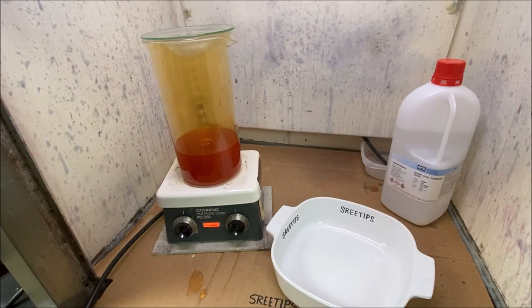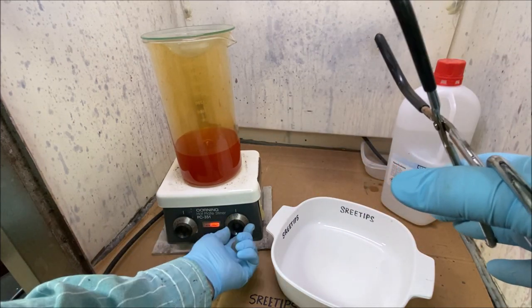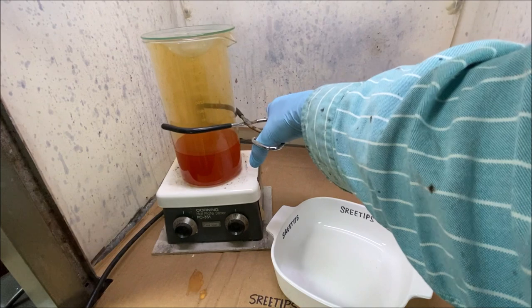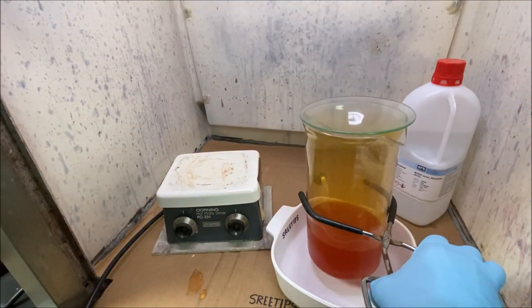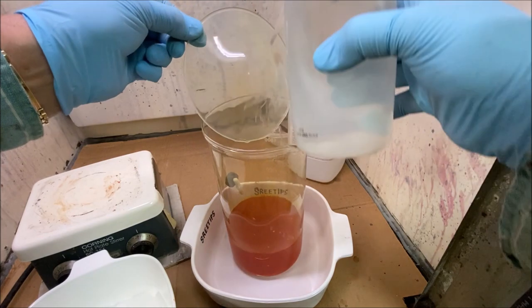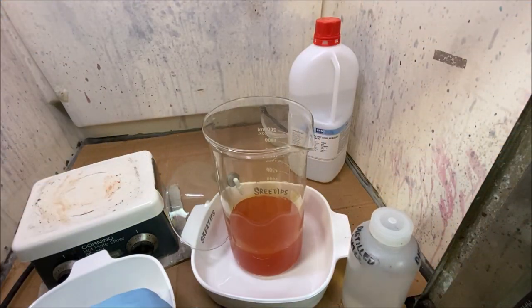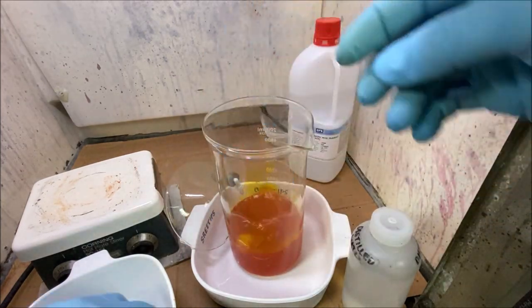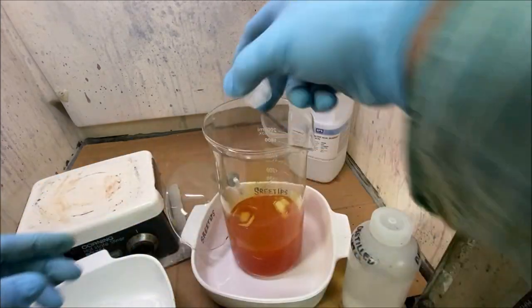That took about a half hour. I'm going to pull it down off the heat now and let it cool off. Now we're going to add some ice. This will help cool it off, and it will help precipitate out any silver chloride that may be present in our gold solution.